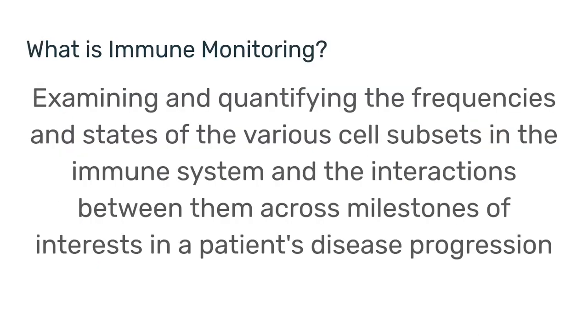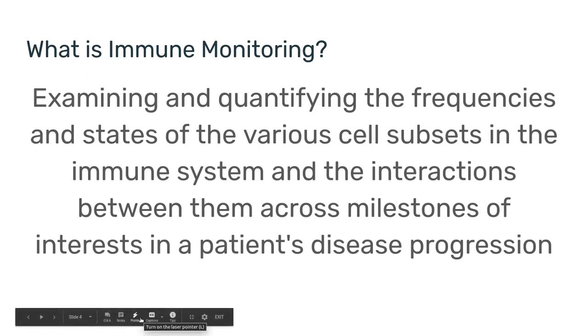So what is immune monitoring? And I'm just going to read a slide here. Immune monitoring, and again this is my interpretation, is examining and quantifying the frequencies and states of the various cell subsets in the immune system and the interactions between them across milestones of interest in a patient's disease progression. So let's go over this definition and break it down a bit.